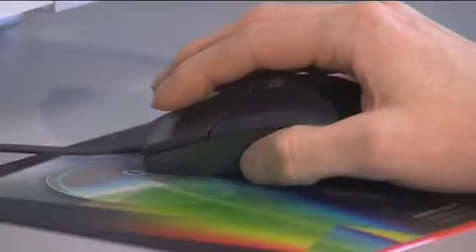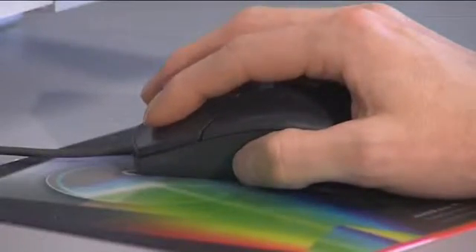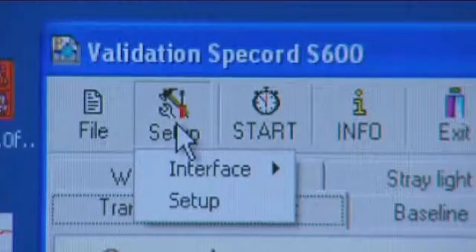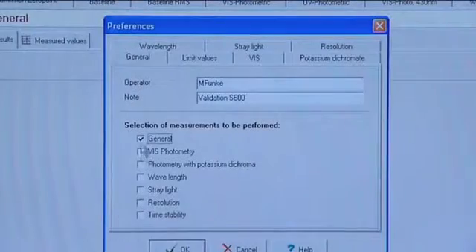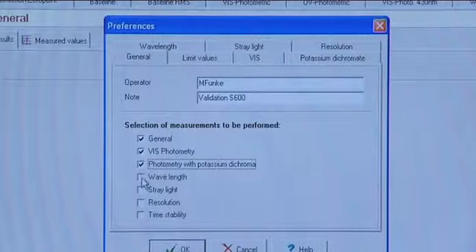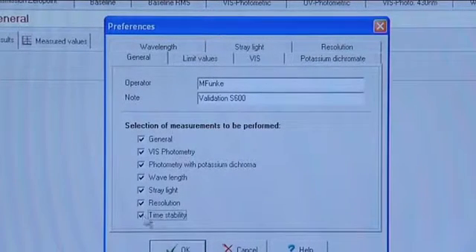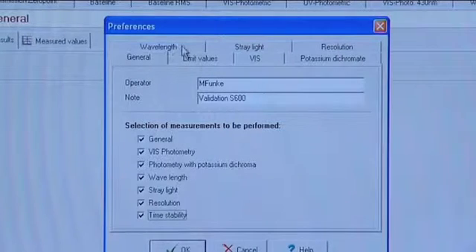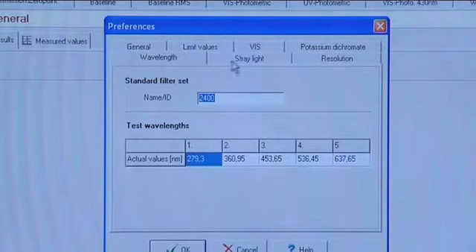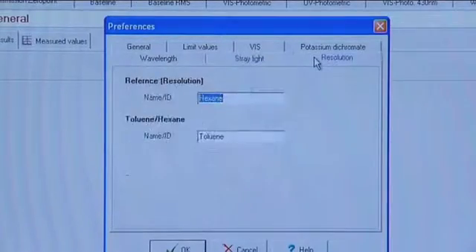With its excellent optical attributes, the Spicord S600 satisfies all demands of international pharmacopoeia. The required parameters, like photometric precision in UV and VIS range, wavelength accuracy, wavelength reproducibility, stray light, and spectral resolution, can be verified by means of a validation set.